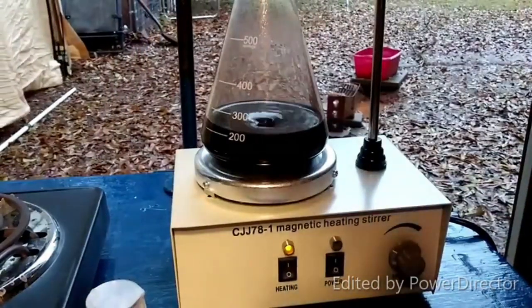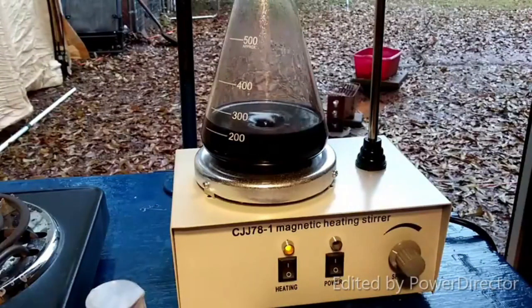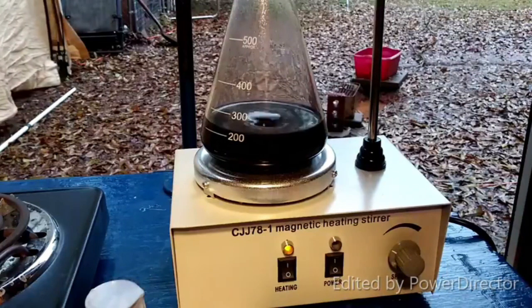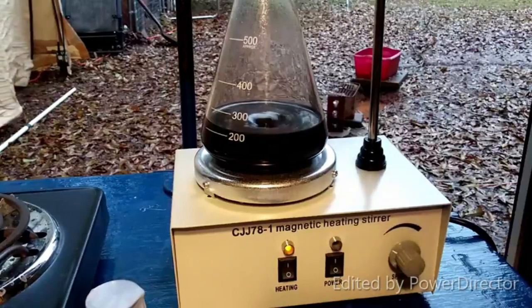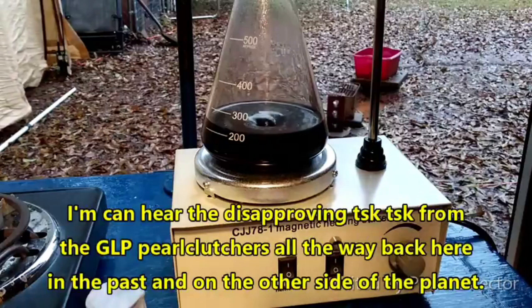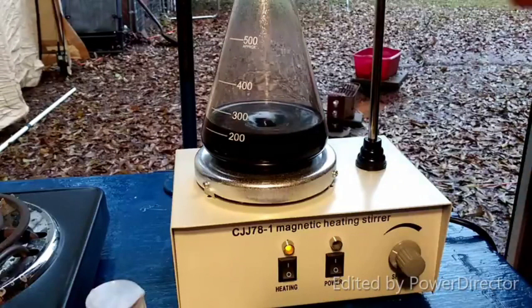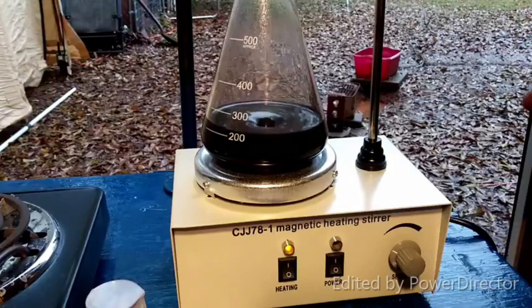And before I had a chance to investigate this eventuality further, I learned why you should absolutely always use a trap whenever you're bubbling gases into something because that reaction died down and it cooled off unexpectedly when my attention was diverted to something else, and so it all got sucked right back up into the sulfur dioxide generator. So, okay, minor problem. What happened was actually kind of cool. And I'm sorry, you just have to rely on me telling you this because I didn't catch it on film.